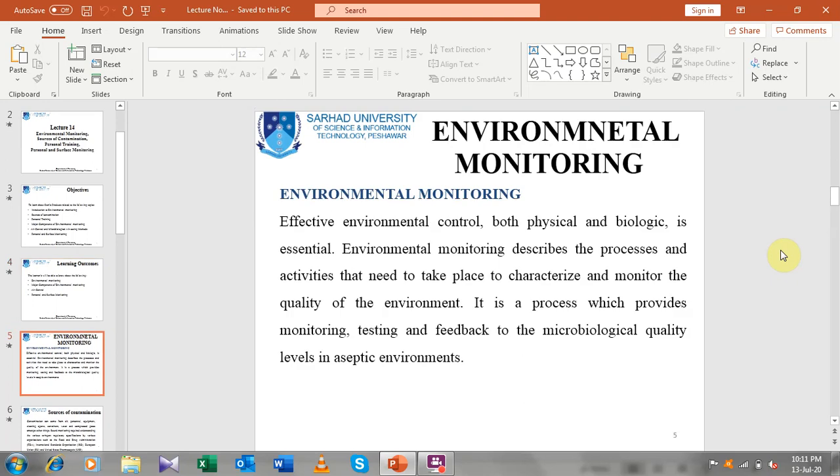Dear students, first of all, I would like to start with environmental monitoring: what is meant by environmental monitoring and what is its importance in the pharmaceutical industry, specifically in the sterile area. Effective environmental control and monitoring of the environment, both physical and biological, is essential and mandatory. It is of prime importance that we effectively control the environment, either physical or biological, in the specific area. Environmental monitoring describes the processes and activities that need to take place to characterize and monitor the quality of the environment.